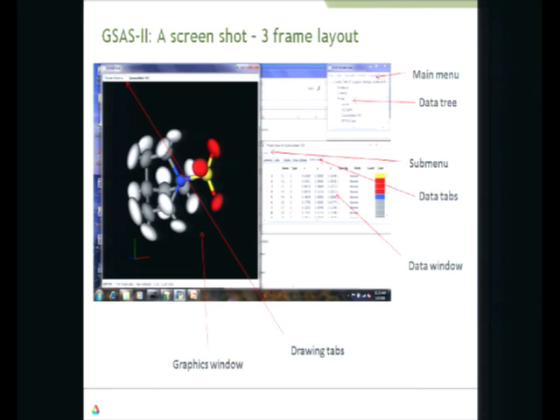There is a menu associated with this particular type of data. And as you change from one kind of data to another, the menus that appear on that bar will change. So there's no point having access to a menu item that doesn't do anything with respect to the data being displayed. That's also part of the philosophy: show you what you need, don't give you a lot of clutter.